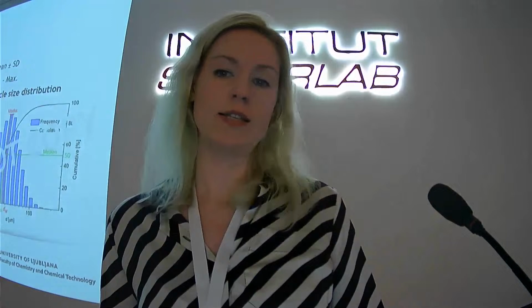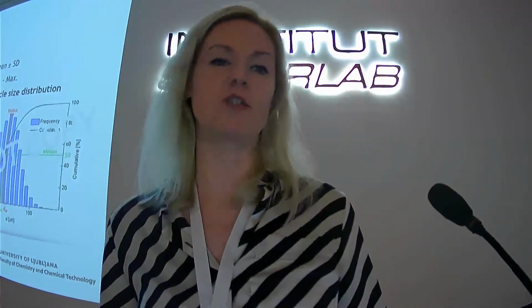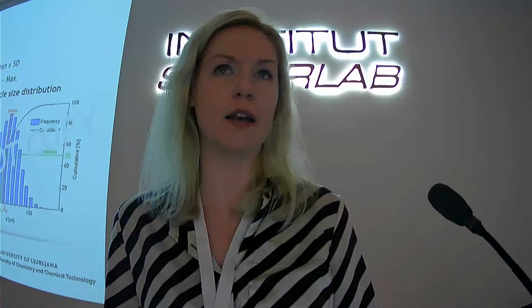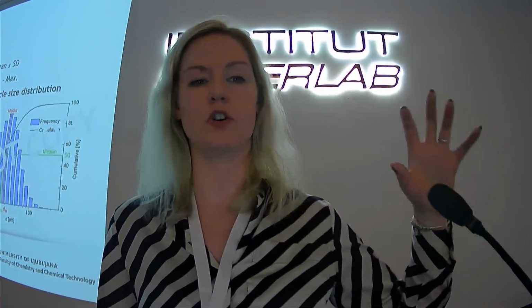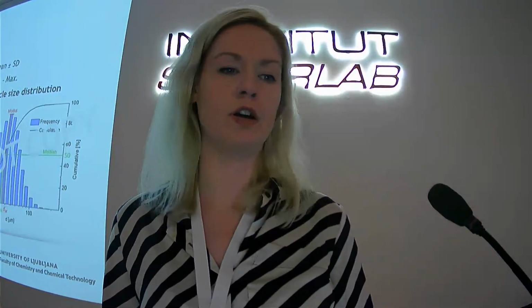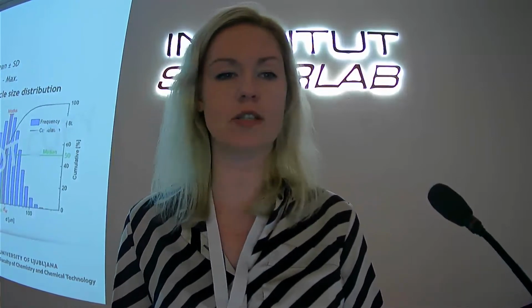And size analysis. This is something that we are quite passionate about. So how can you determine size analysis? The very simplest way is sieving analysis, but you are usually getting just the size fraction, so the weight of the specific size fraction depending on what your sieves are, so what the sizes of the meshes are.